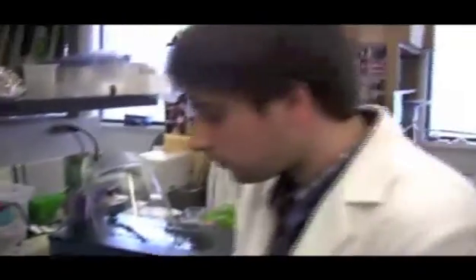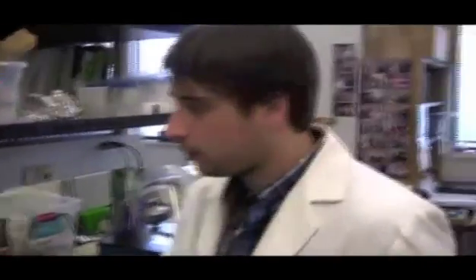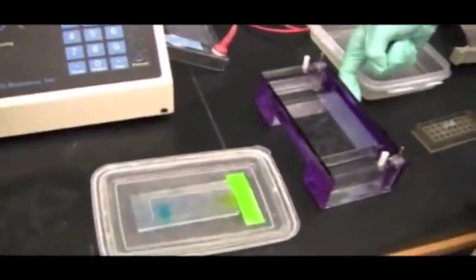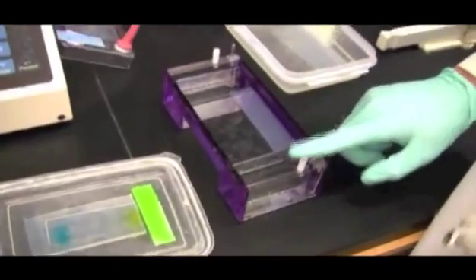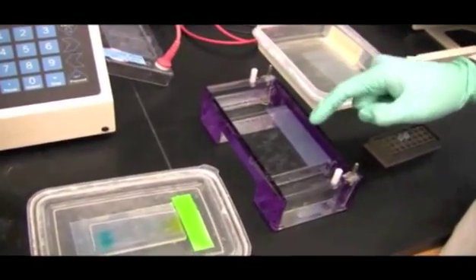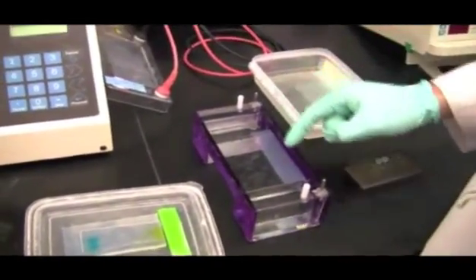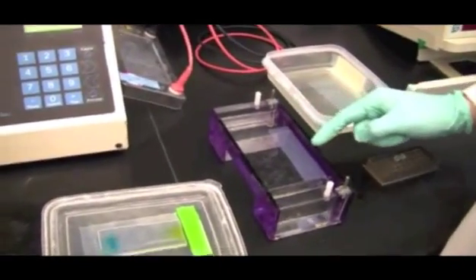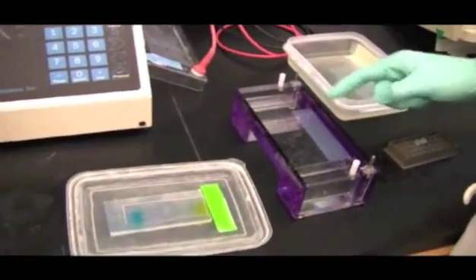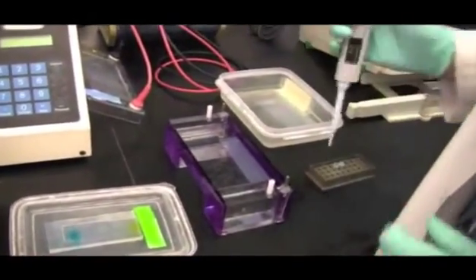Okay. So hopefully you guys answered that question. And hopefully you found out that DNA is negatively charged, so it's going to follow the positive electrode. So if we put our DNA up here on this gel, and put the positive charge down here and a negative one up here, our DNA will try and move through this gel and it'll go towards this positive electrode down here. And hopefully you also answered that the smaller pieces of DNA are going to move through much faster, because like I said, this is just a bunch of molecules that make it difficult for DNA to move through. So if we run the DNA through this gel based on a charge, it will separate it out according to size. And if we know about how big our piece of DNA is going to be, we should know where to find it within this gel. But first we have to load it in there.